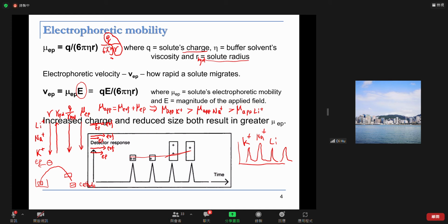They're neutral compounds. They're not attracted to the cathode. They're not attracted to the anode either. So for the neutral compound, they have no acceleration or no pulling. So they're just in the middle.